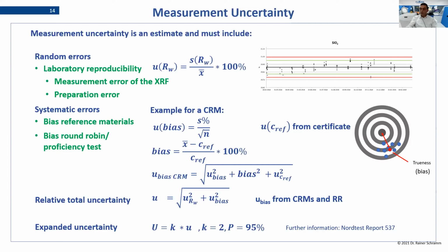When setting up a new instrument, how do you suggest we set the control limits when there isn't enough data available to set them? This is a very good question, because this is always our problem when we start from scratch. We have no data. So then I would recommend that you take a control sample, and for example, on 5 days a week, every day you measure it several times.